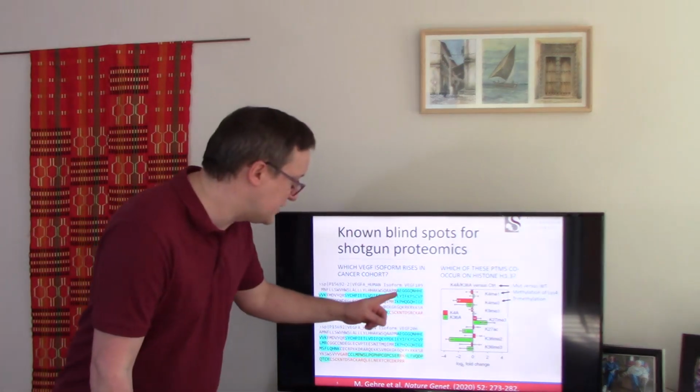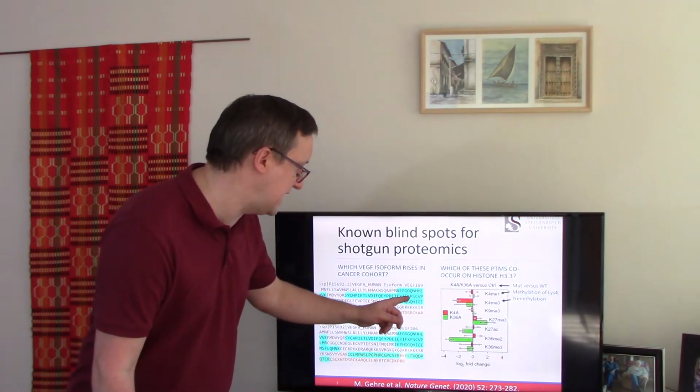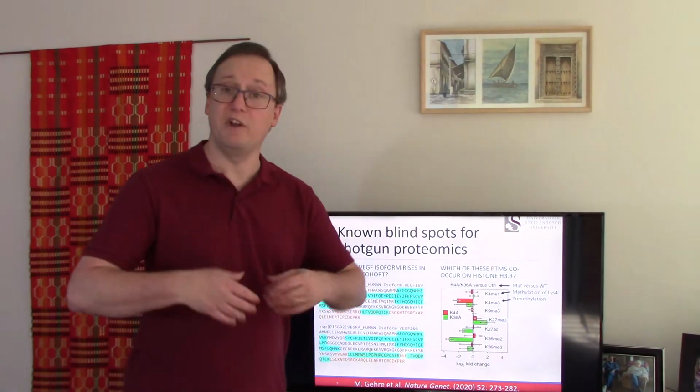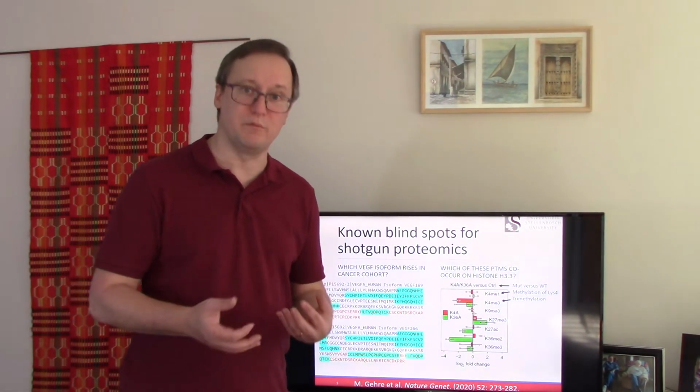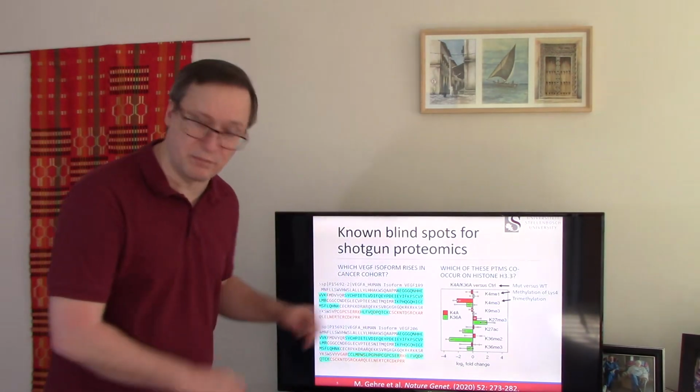Alright, so you can imagine then that we have a peptide that stretches from here to here, another peptide that stretches through this really long region up to this K, and then another one that continues on from PSC, etc. And so all these blue regions represent measurements. They are peptides that we have observed from these proteins that are present.